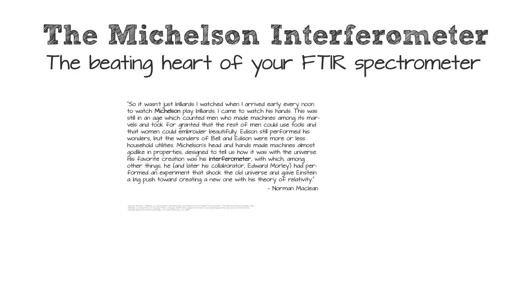So we've had an introduction to UV spectroscopy and we've seen how that instrument works. And now I want to talk to you about how your Fourier transform infrared spectrometer works. It works very differently. It doesn't select a wavelength of light, shine that on a detector, and measure the power of that particular segment of light, and therefore determine which wavelengths of light are making it through the spectrum.